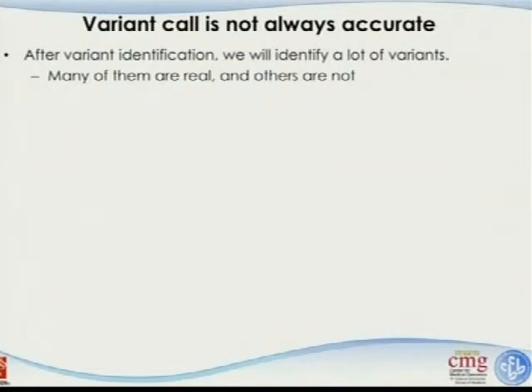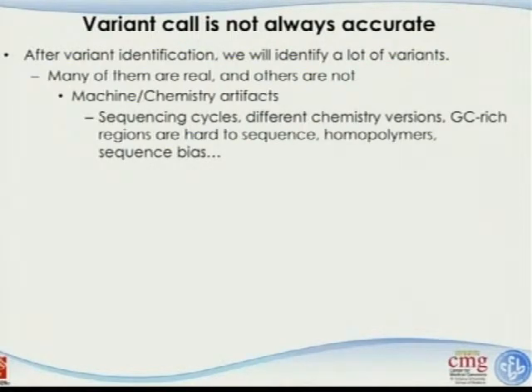But for some of the methods, you just throw the data into some alignment algorithm, then throw that into some variant identification. If that's the case, there will be a lot of miscalibration there. Similar to the base errors, there are a lot of factors that determine this.